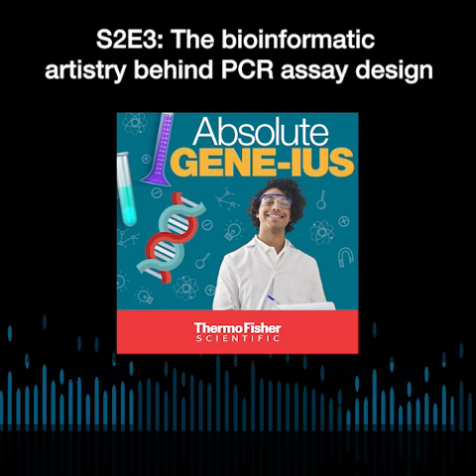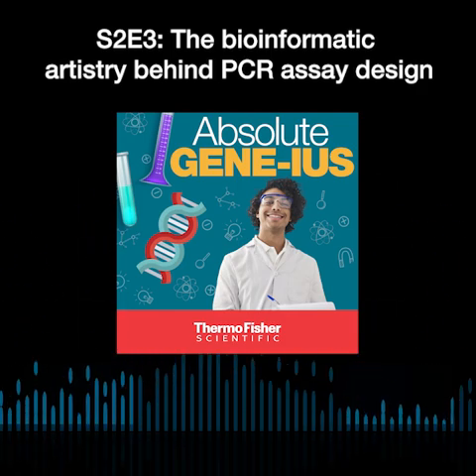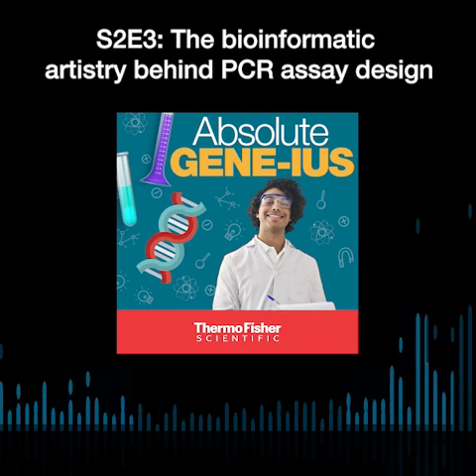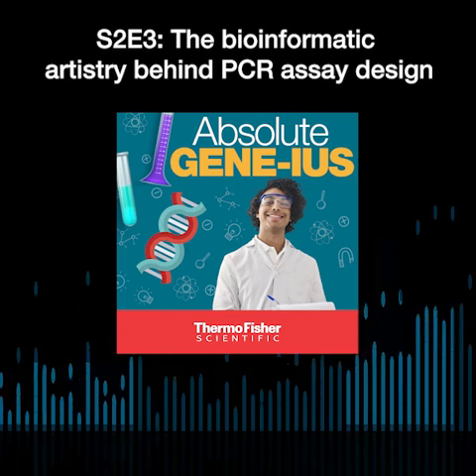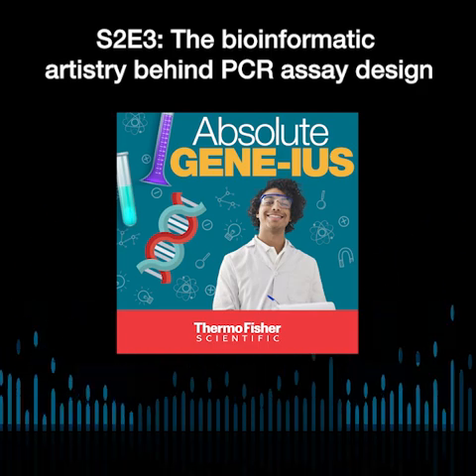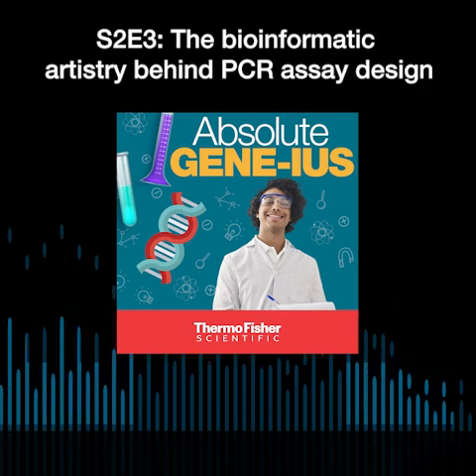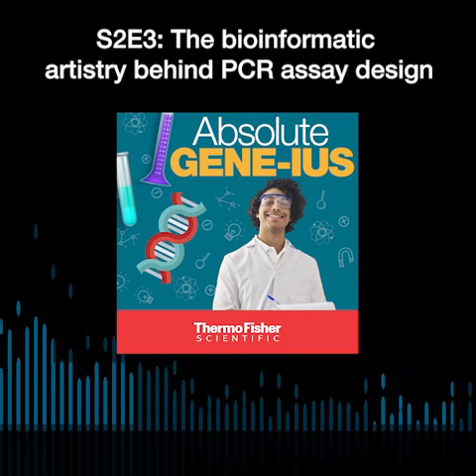So for example, if you're dealing with degraded samples, FFPE samples, your assay should be designed with that in mind, such that your amplicon length is short enough to be able to amplify a degraded target. So I think that's an important logistical consideration that you should have.